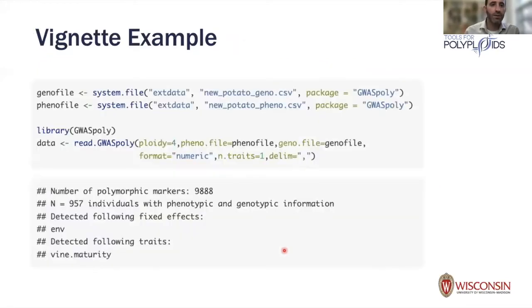Okay, so let's get into it. Another change compared to last year is that the example data set in the vignette is improved, or larger at least, compared to the original vignette. The original data set that came with the publication from 2016 is at this point close to 9 years old. So I felt it was worthwhile to use a newer data set that's more representative of the kinds of GWAS panels that people are looking at now. It's quite a bit larger, close to 1,000 individuals.